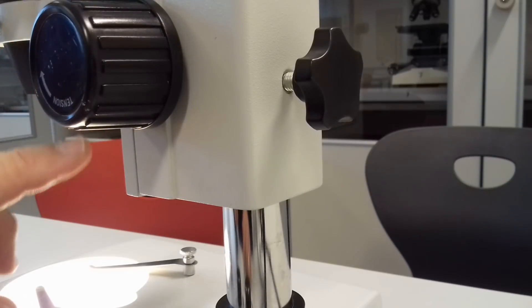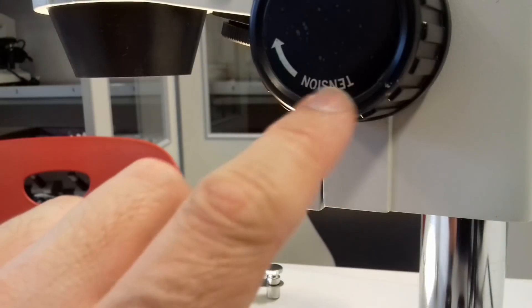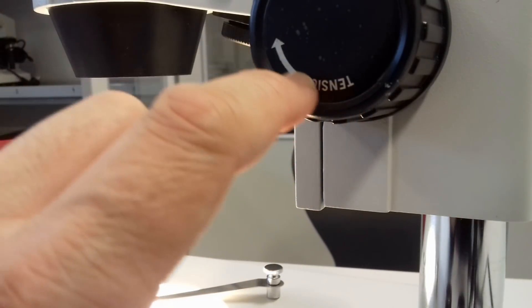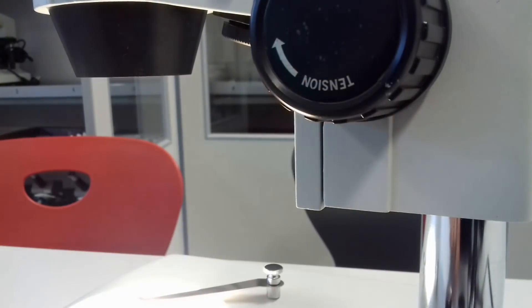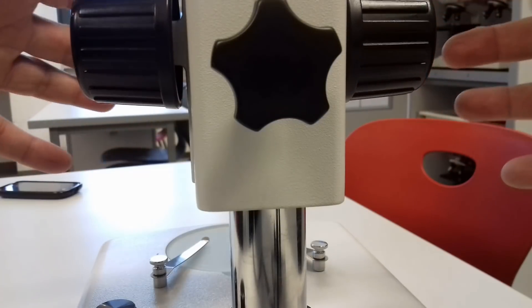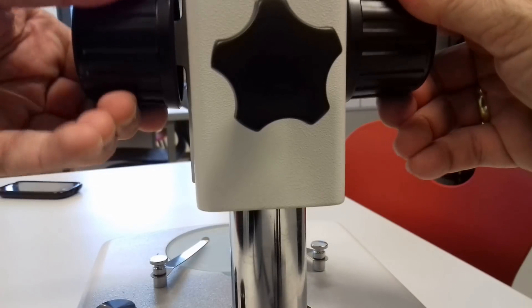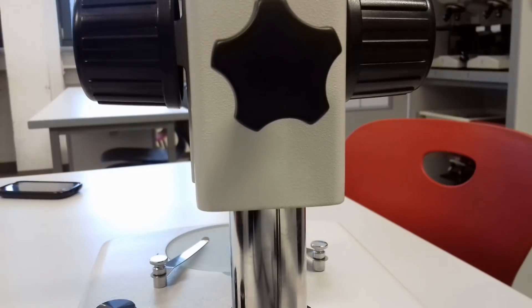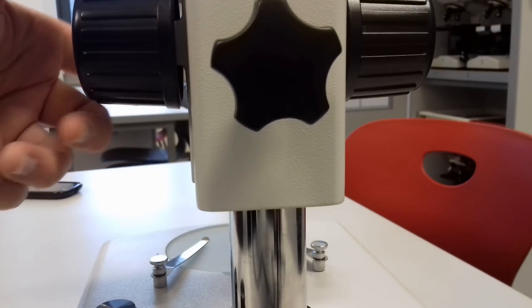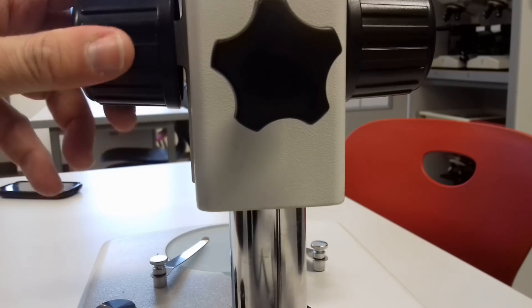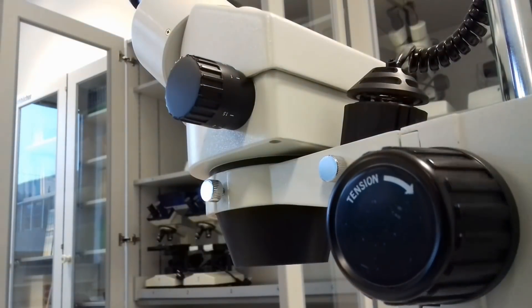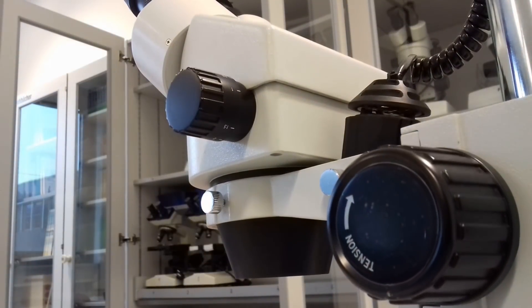And what you also can see is that on the knob there is the word tension written on here. What does this mean? You can turn the two knobs against each other and this allows you to tighten the focus. So right now it's tightened and you can focus easily. But if it is too loose, then there is a drift, a focus drift, and you can see that the whole head moves down on its own weight.